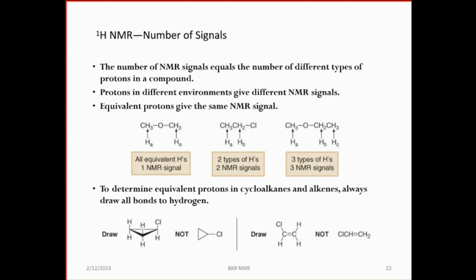Okay, so now see, all the organic molecules have only hydrogen. So everything is hydrogen, so they should all give the same frequency, the same resonance, resonating at the same time, because they have the same gyromagnetic ratio. So they should all split in the same way, because the splitting is equal to gamma into B0. Gamma of hydrogen is the same for all hydrogens, so all should split the same.